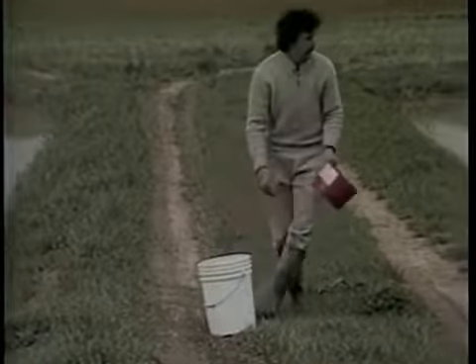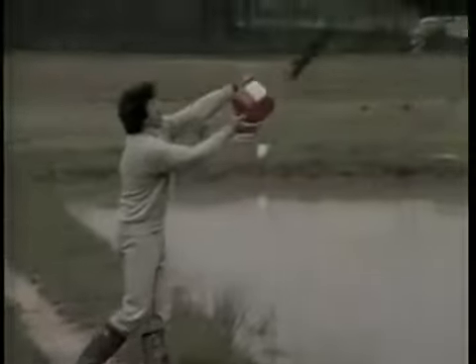It should be mentioned that total alkalinity is composed of three types of alkalinity: hydroxide, carbonate, and bicarbonate alkalinity. Relationships between these types of alkalinity are normally included in test kits, and may prove confusing. However, what fish farmers are interested in is total alkalinity, which may be measured as described.